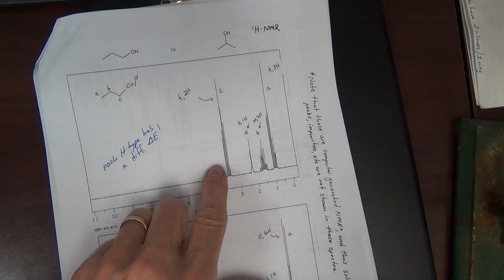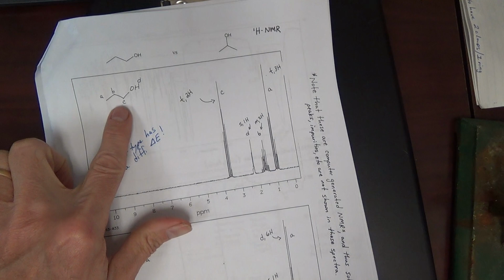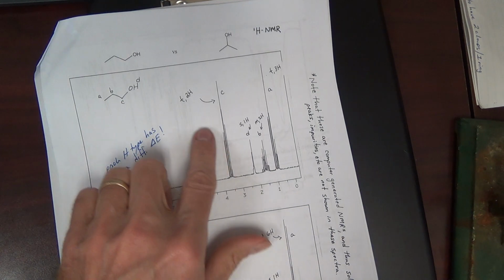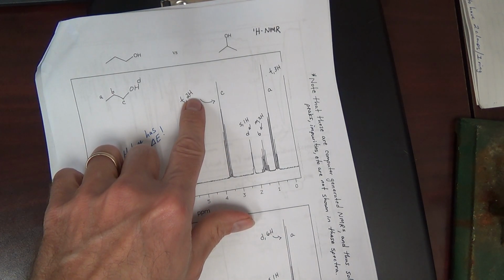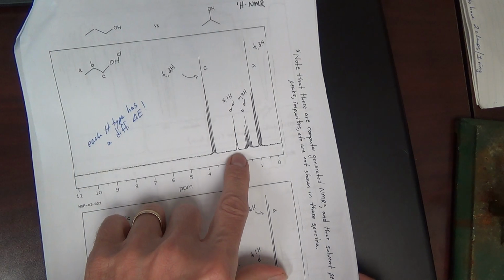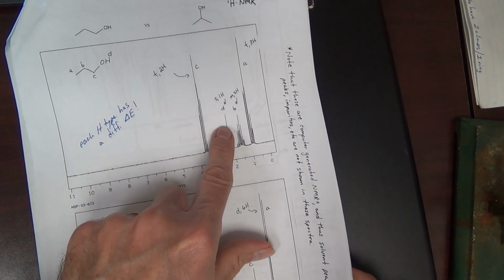And what we see in this top spectrum, which is for 1-propanol, we have a triplet. It's a signal, but it's split into 3 lines. It's called a triplet. And the integration is given here as 2 hydrogens. That's how I will typically give the integration. We also have a singlet, just 1 line. It's a little broad at the bottom. It's a little bit unusual, but it's a singlet.